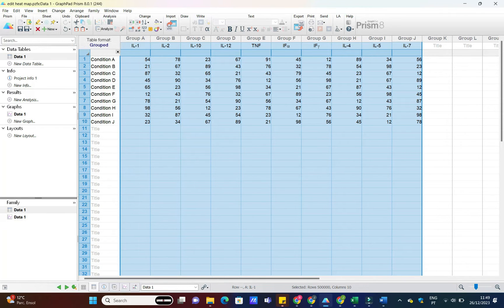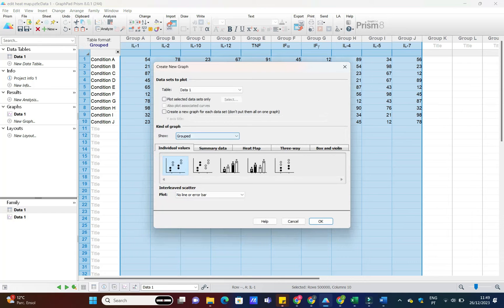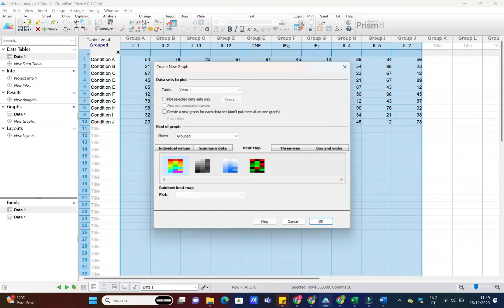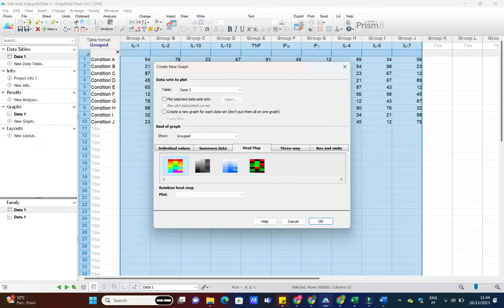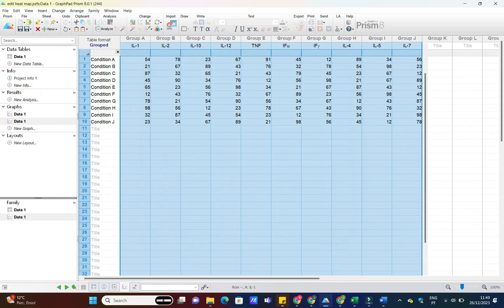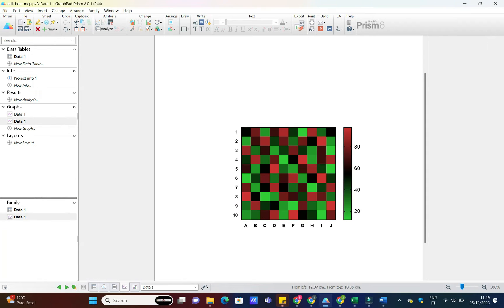Navigate to the Insert tab, select Insert Graph of Existing Data, and choose the appropriate heatmap. GraphPad Prism will generate a default heatmap for you, but we're not stopping there. We want to make it uniquely ours.